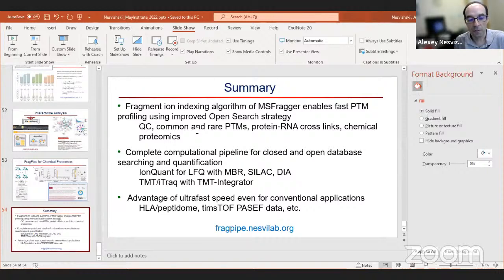You can narrow down to 0.8 delta on the Lumos, but with all the Fusions you have to go with higher windows because the ion optics weren't that great. So there's still a pretty wide window, and you're actually isolating not just the target peptide, but possibly some co-fragmenting peptides.